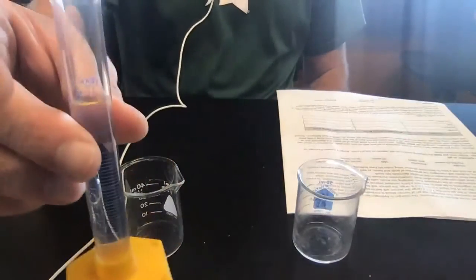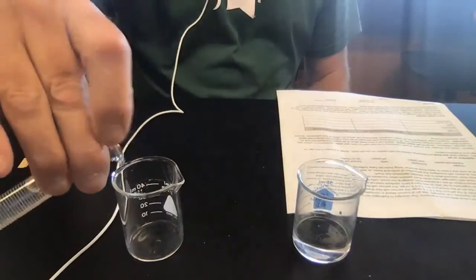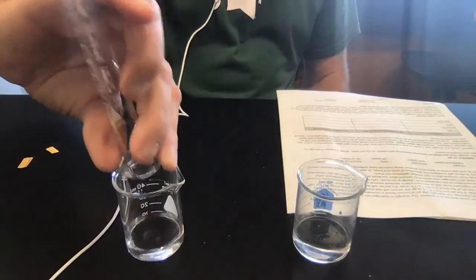So I've pre-measured 10 mLs in my graduated cylinder. There's 10 mLs of water. And I've got a second one that I also measured 10 mLs of water. And we'll put that in the beaker.